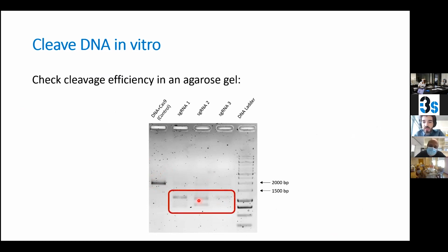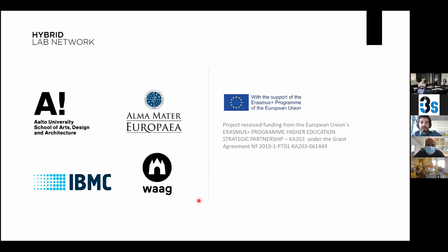This was done by Joanna Marques last week. So hopefully we are going to see the same thing happening tomorrow. Let's see if we can cut this in vitro.